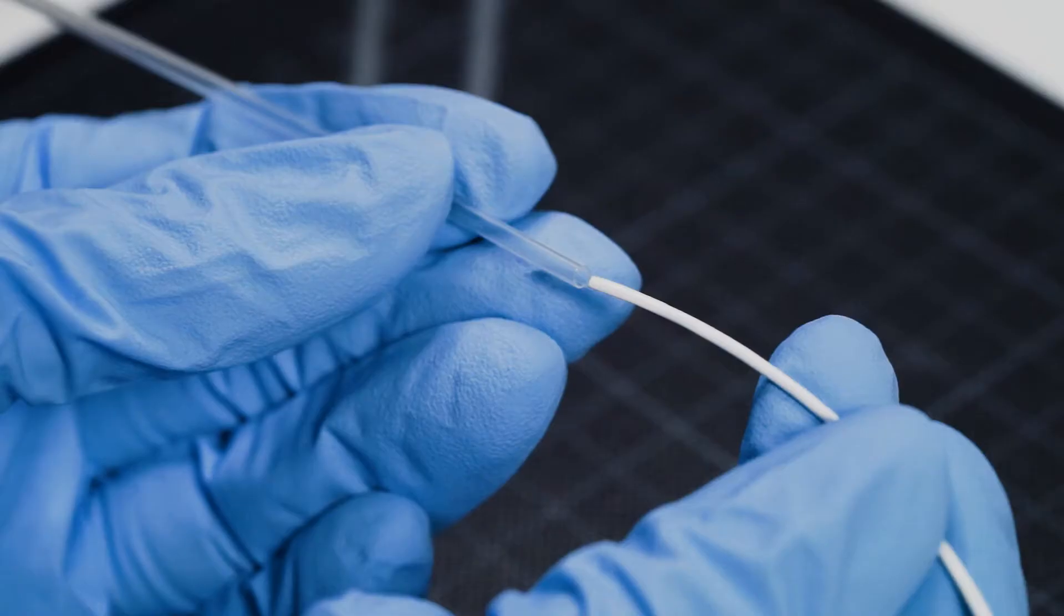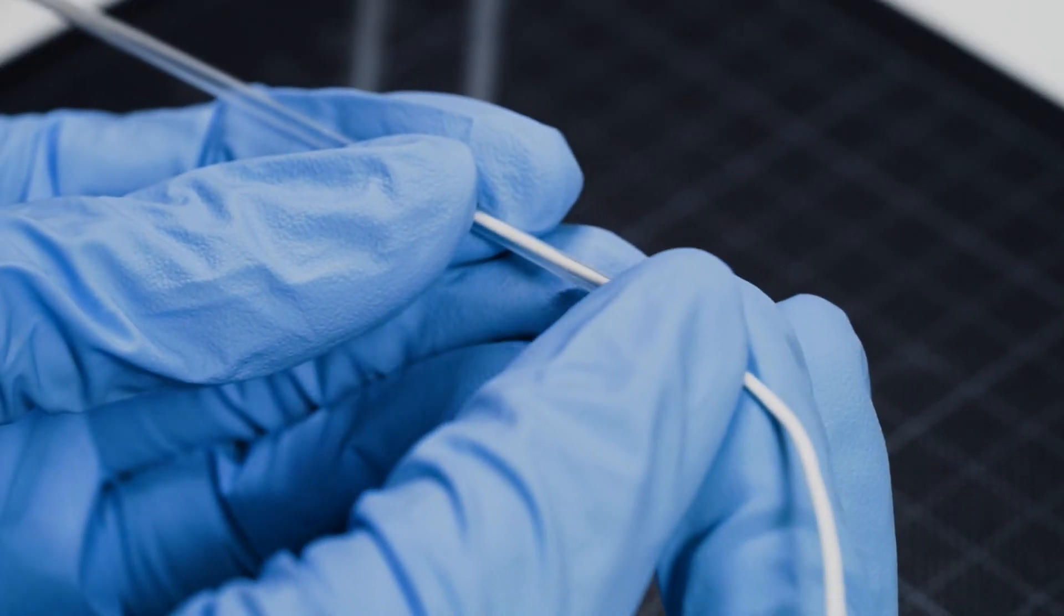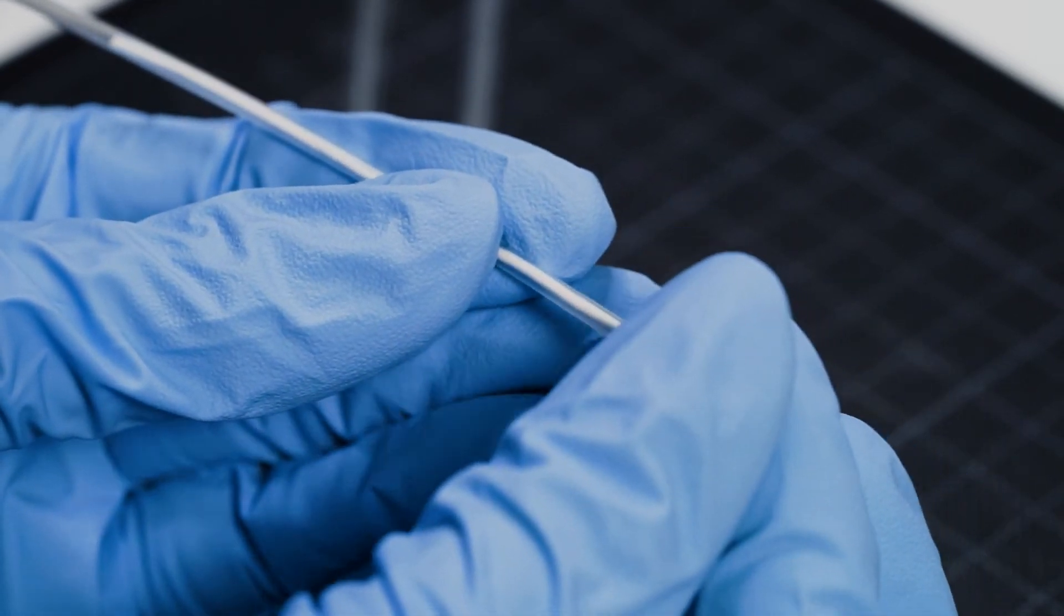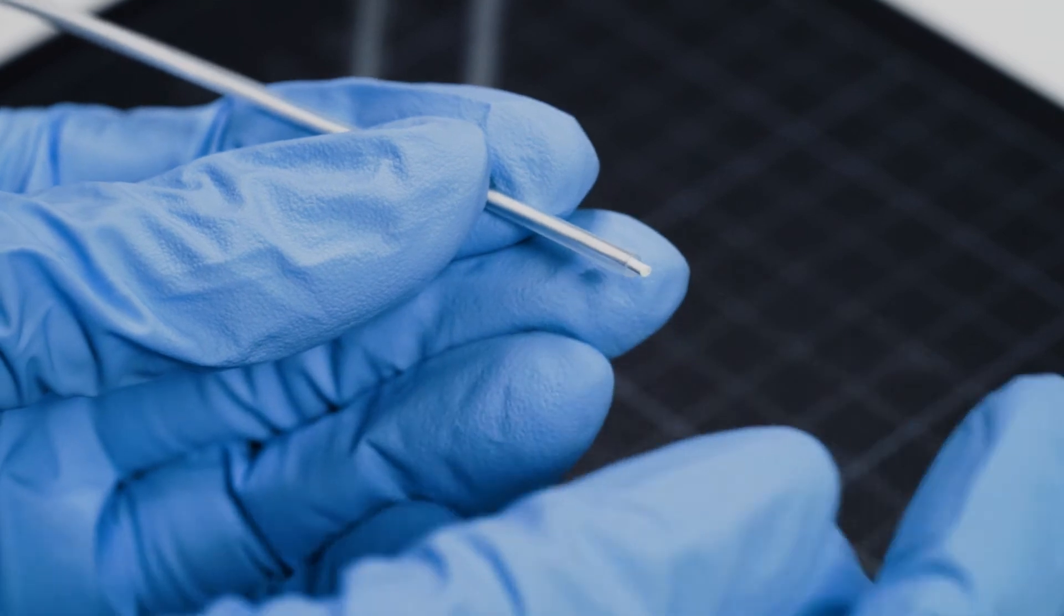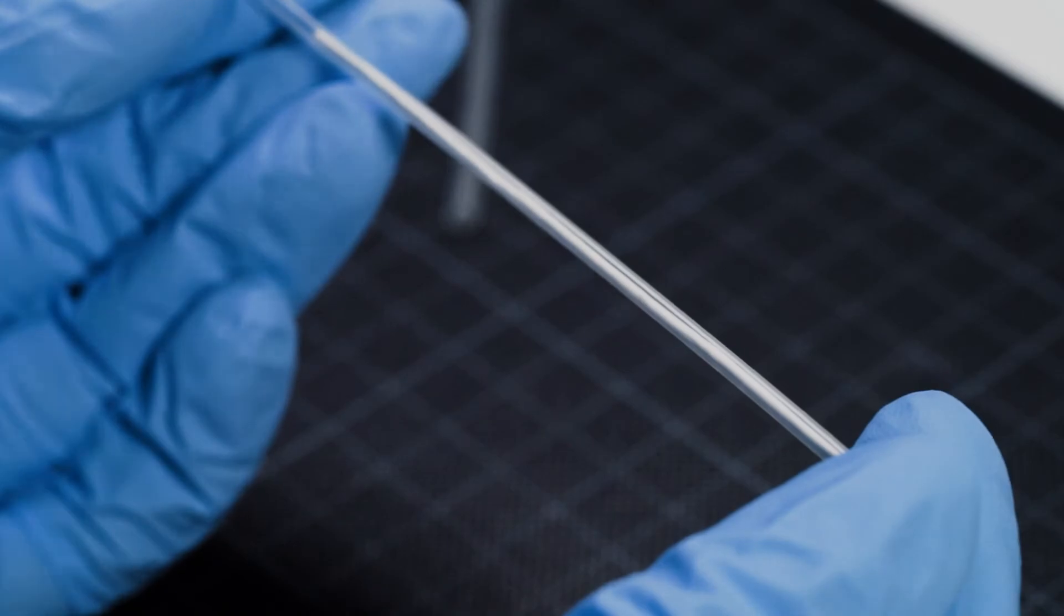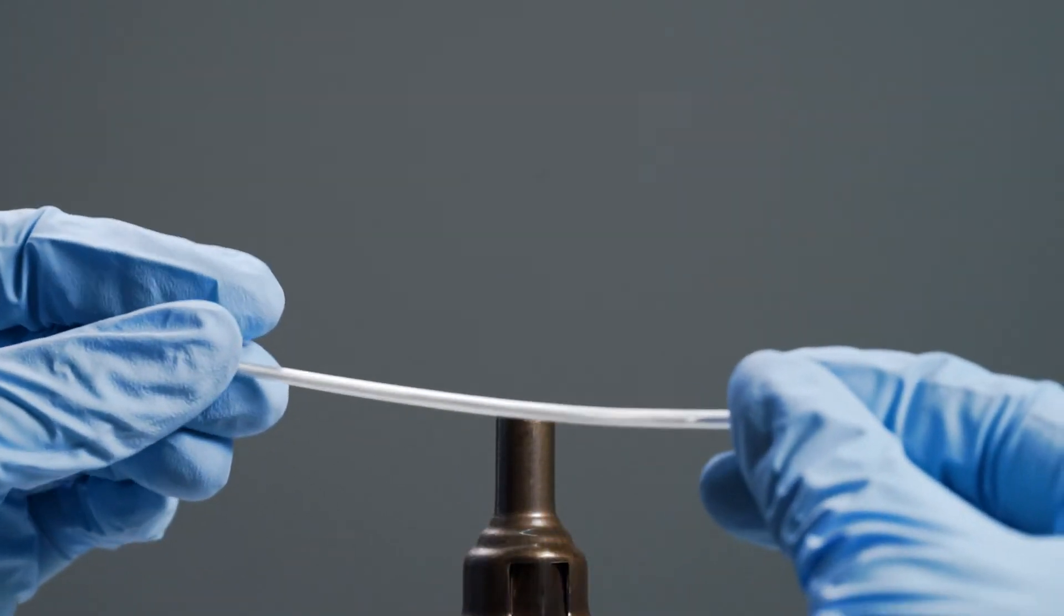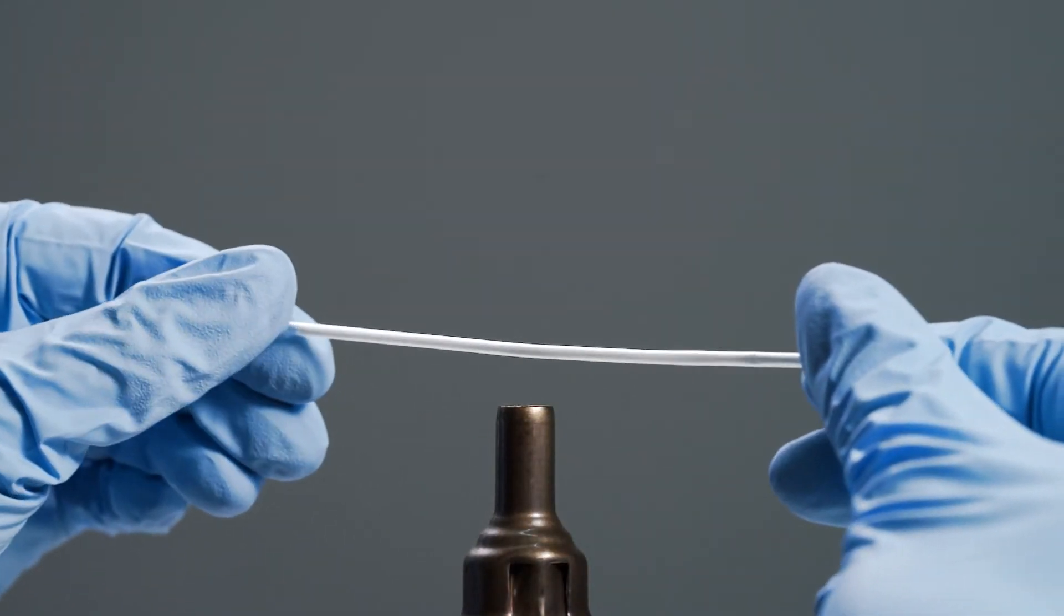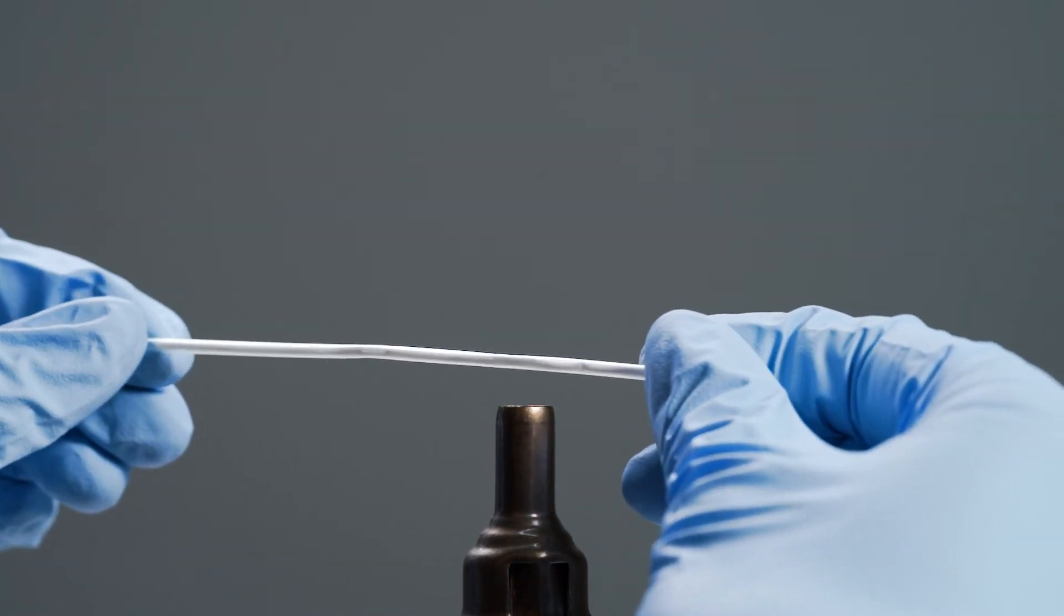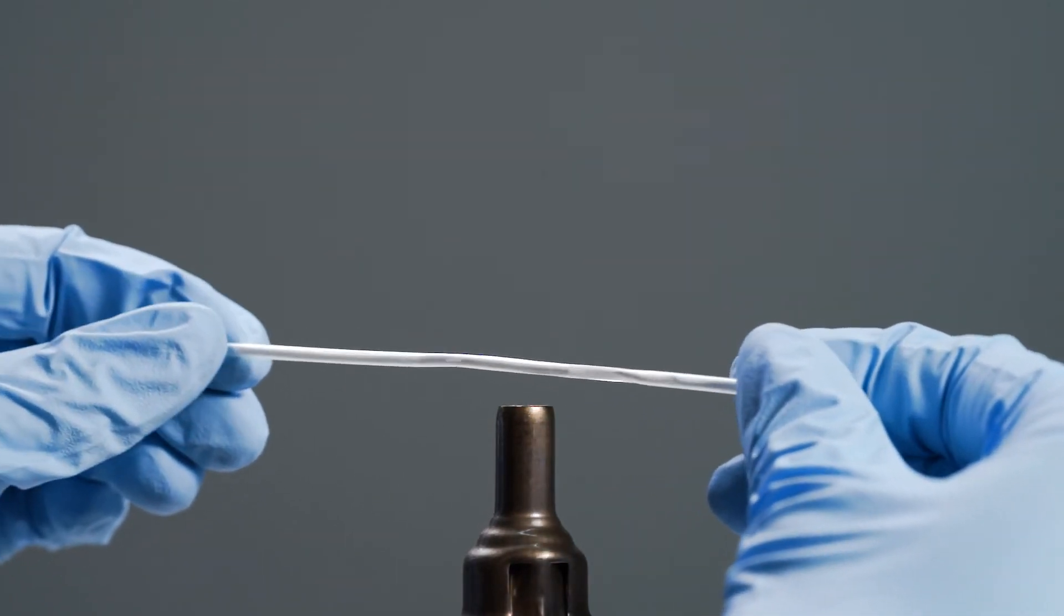Insert the hollow fiber membrane into the heat shrink tube. Shrink the tube using an appropriate heat source, for example, an oven or hot air gun, at a temperature of approximately 110 degrees Celsius or 230 degrees Fahrenheit.